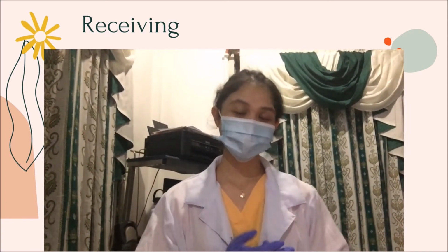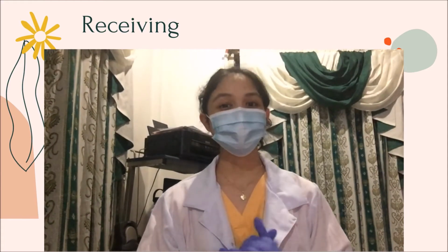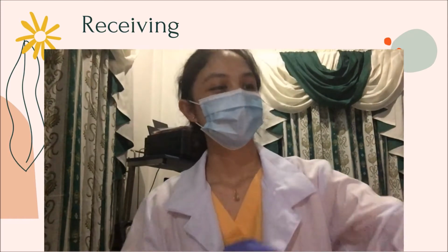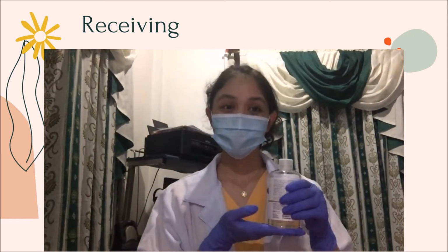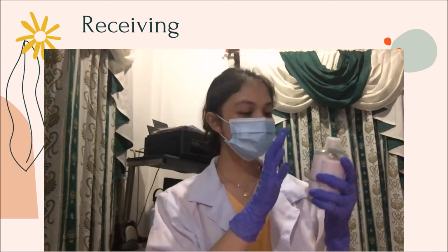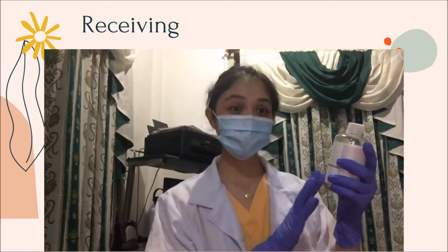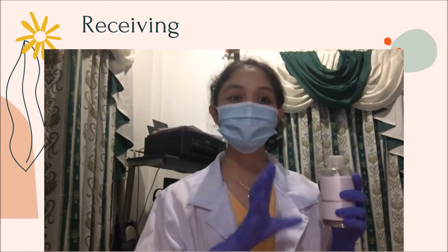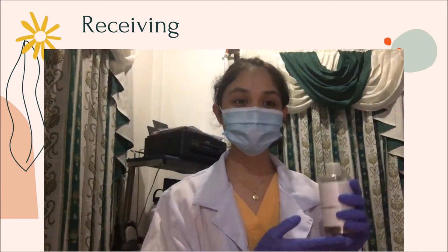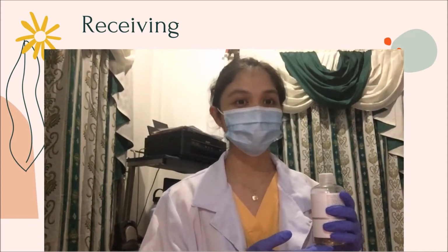So here in the histopathology laboratory, what happens first is the receiving of the sample. Thank you, sir. So when you already have the sample, it is your job to make sure that all the necessary information is filled in this container that contains the sample. Because incomplete labeling of your sample could lead to the rejection of it.